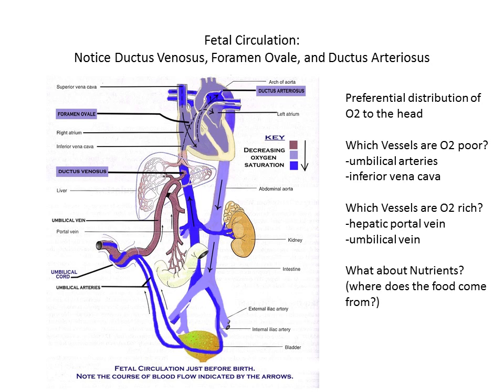And this one I need to remind myself. Okay, so after class helps out Dr. Burns, we learn that the ductus arteriosus connects the pulmonary trunk, which is the pulmonary artery, to the aorta directly, thus bypassing the lungs.